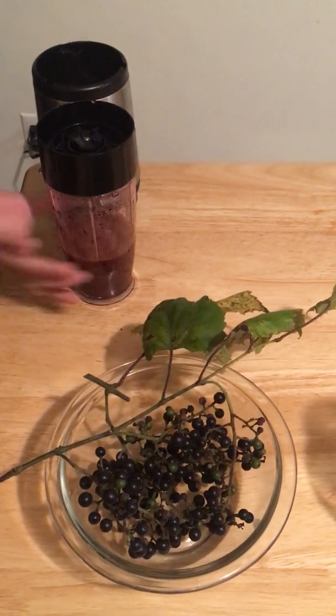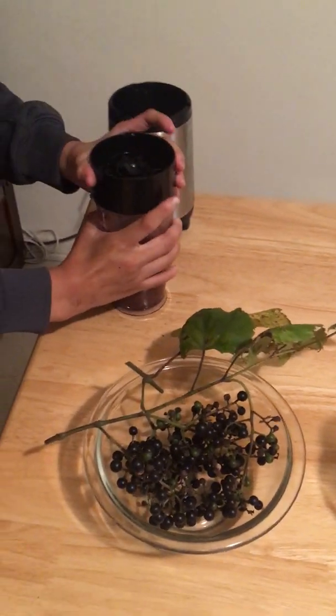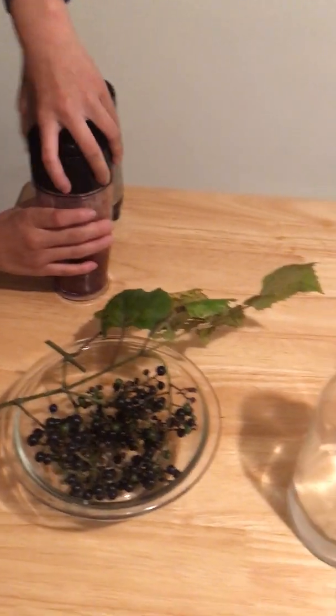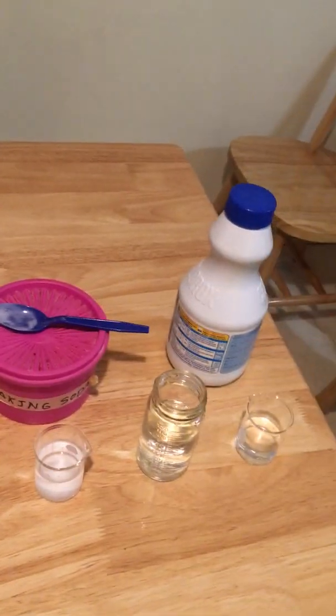So now we have this ground-up pile of grapes here. We're going to take the lid off and pour this grape slop into a variety of different solutions that we have here.